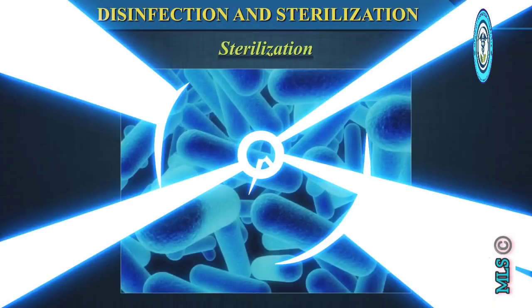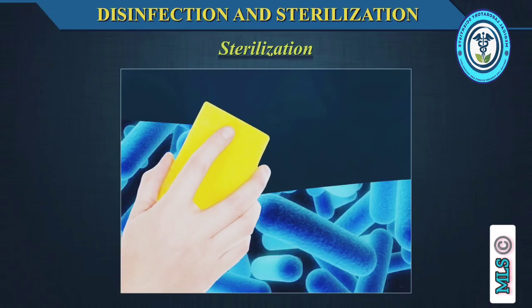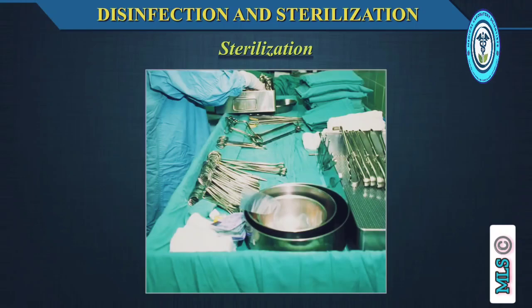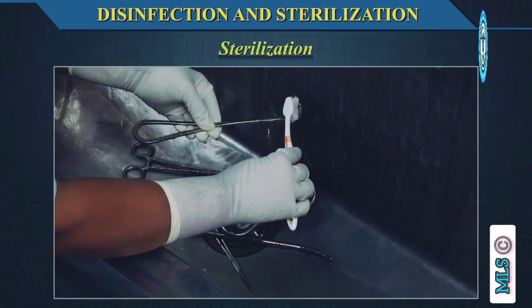Sterilization. Sterilization is the destruction of all microorganisms and can be achieved by either physical or chemical methods. Sterilization is necessary for medical devices penetrating sterile body sites. Cleaning to remove visible soiling on reusable equipment should always precede sterilization.